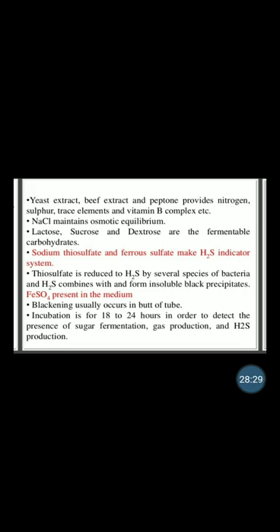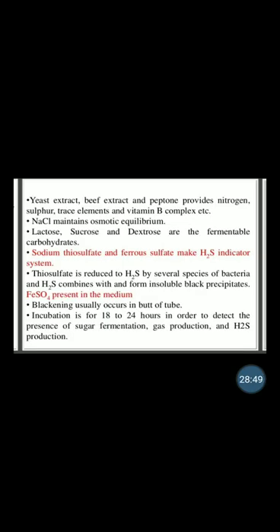Then incubation is for 18 to 24 hours. Why is it essential? In order to detect the presence of sugar fermentation, gas production and H2S production. This is the need for incubation.